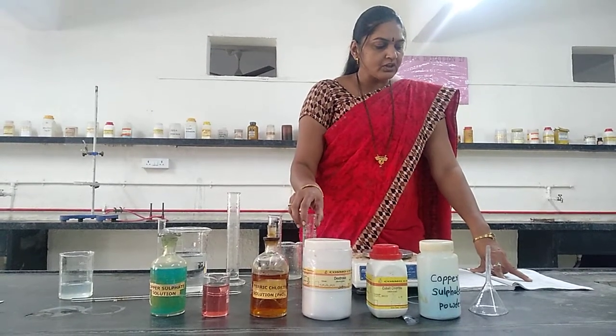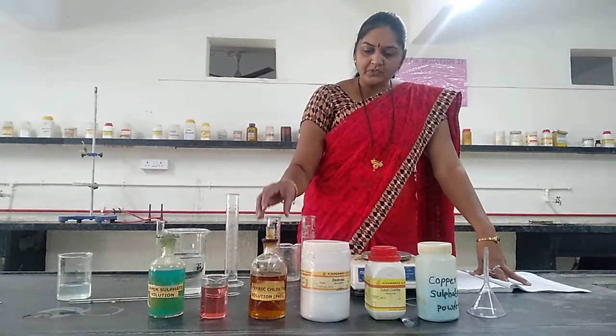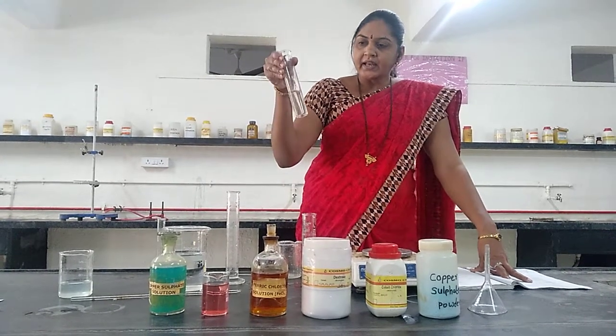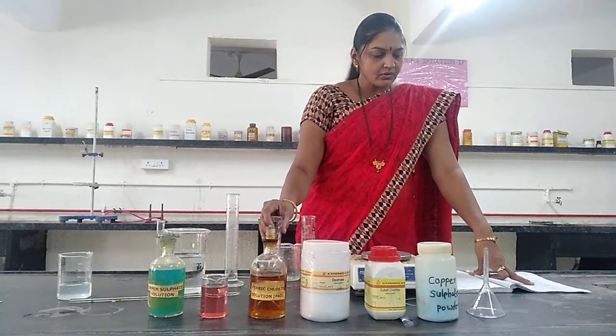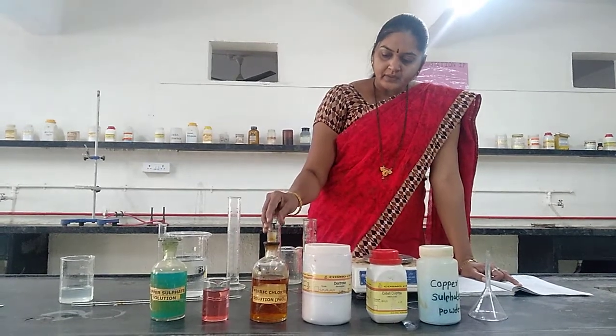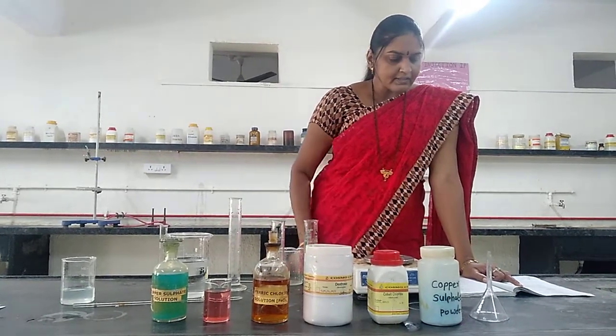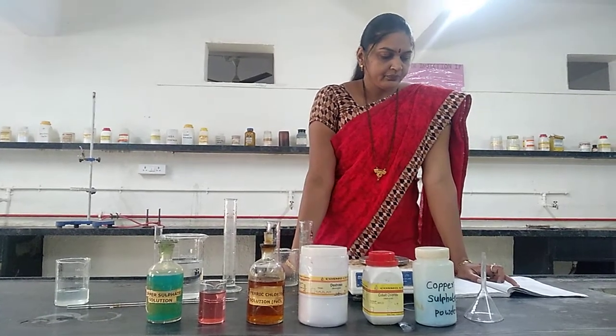So interpretation of result: the intensity of color of the sample solution is less, and the dextrose solution is colorless. Hence, it complies with the test for IP 1985.